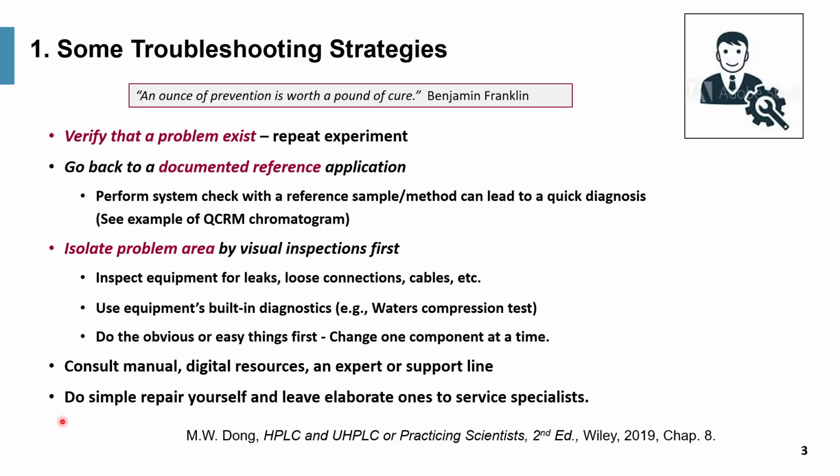So it's always good to learn how to do some simple repair yourself, as explained in the previous video, and note when to leave the elaborate ones to service specialists.